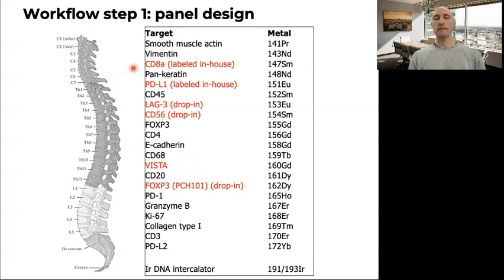The labeling kits have a very robust protocol. So in 4 or 5 hours, you can label anything, if this anything means purified IgG without any carrier. So you can label any antibody you want. And this is what we did here, and what we did even with PD-L1, because the PD-L1 in the original panel doesn't work for us.